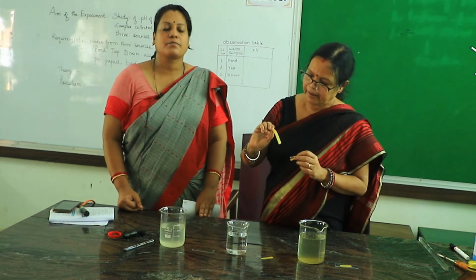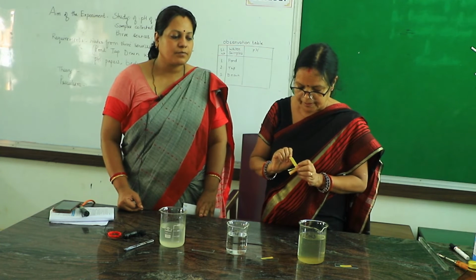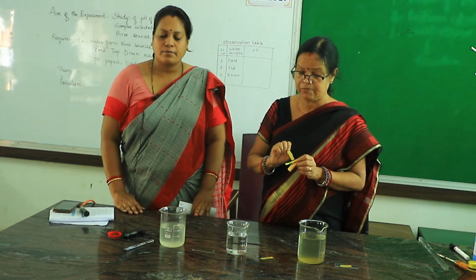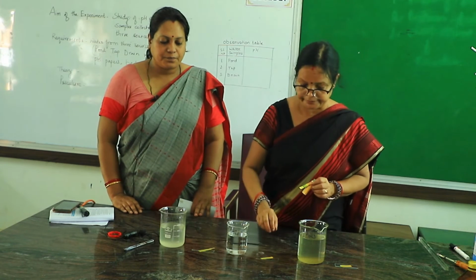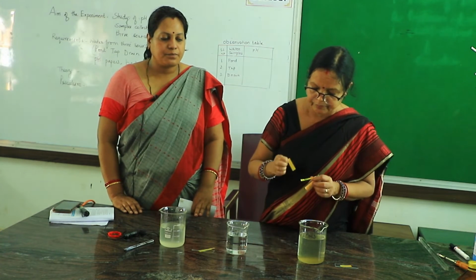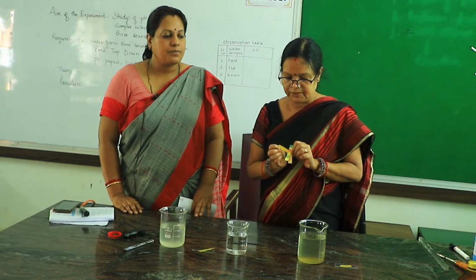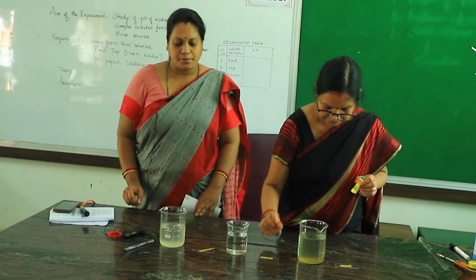Look here, it is slightly green color. It is between 6 and 7, that is 6.5. Which one? Drain water, yes, 6.5. Acidic. It is slightly acidic because of the presence of organic matter. Next is tap water. It is almost light green. Look at it, match with the 7 pH. So it is neutral. So tap water is neutral.